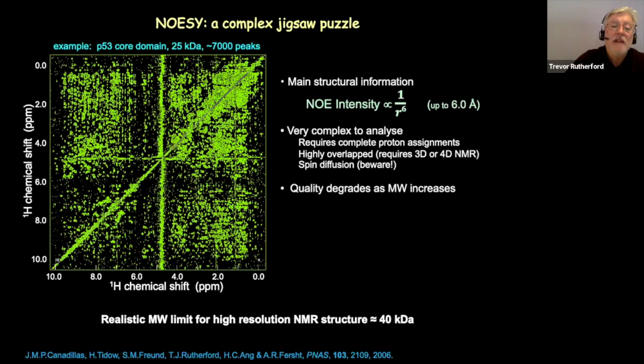In this spectrum, we got something like 7,000 peaks, and the traditional process of interpretation of this is that you have to get in there and interpret them by hand. Certainly, it's one of those processes that is of active research interest for the artificial intelligence community, looking at ways of automating this. But at the moment, as things stand, we don't have reliable enough automated interpretation of these data. So you get in there and you interpret this data by hand.